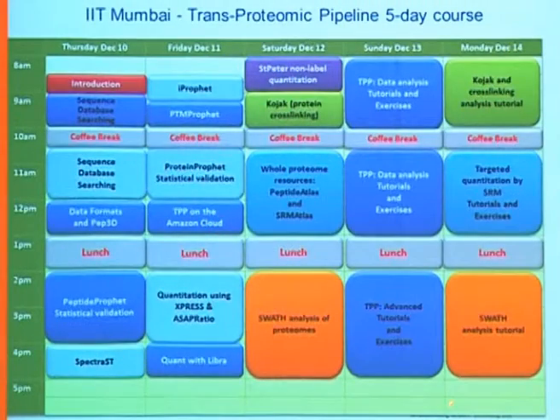So the rest of the components, you will have the software and you'll be interacting with some of the programs that we've got. But apart from that, this will be just a viewing exercise so you can see how SWATH data can be processed and you can get to see some of the results. So this is where we are. We're going to be doing most of the interaction stuff this morning. Then after lunch, that's when we'll do some of the SWATH analysis as we finish off the day.